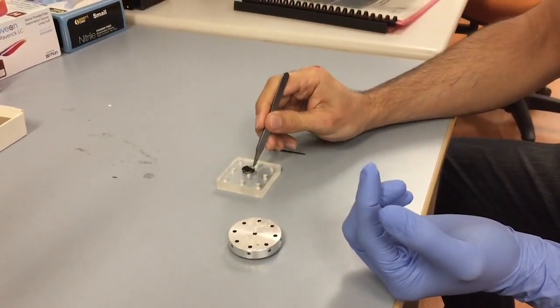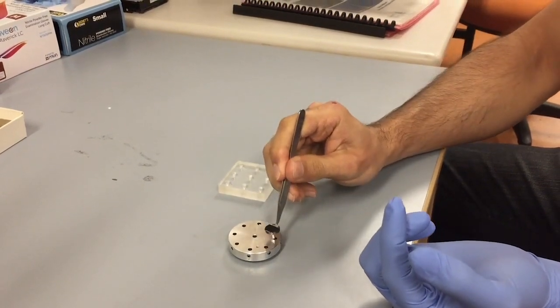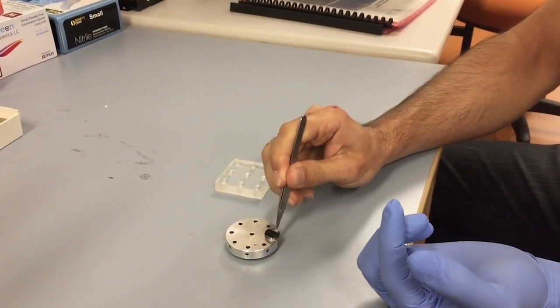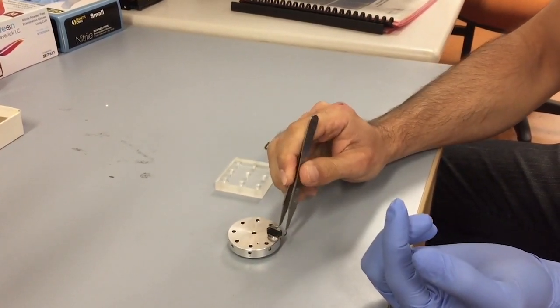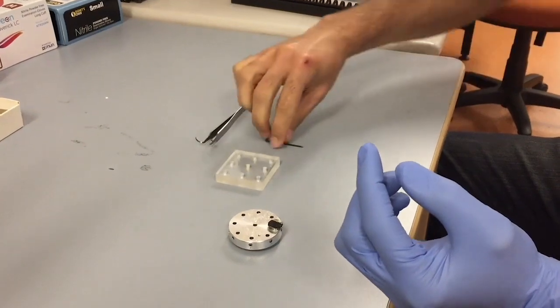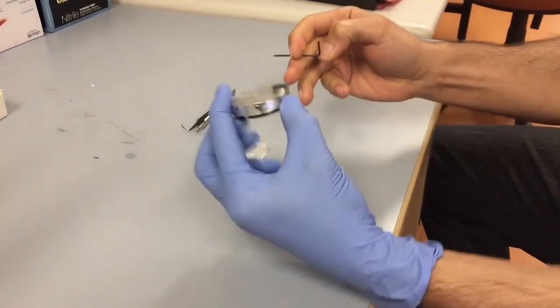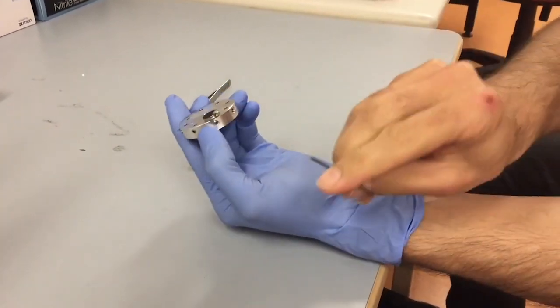Using the circular tweezers, place your samples in the pinholes on the mount. Gently tighten the hex screws using the key. Do not over tighten these screws.